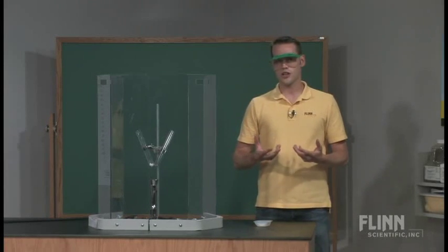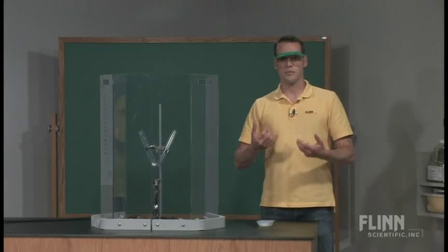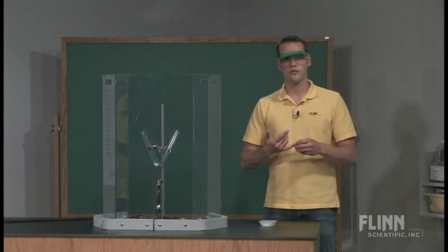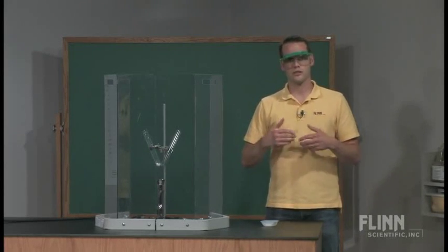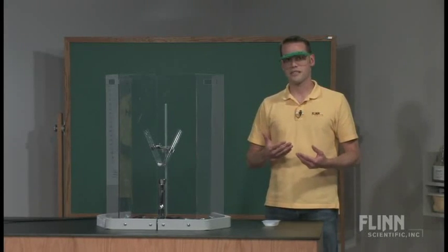This reaction also generates a whole lot of particulate matter that goes up into the air, and it can make your room very, very stifling if you don't have good ventilation. So this is not a good demonstration to do if you don't have proper ventilation or a fume hood. And if you don't have a fume hood, you definitely need to have some kind of a purge fan above this and safety shields and blast shields to prevent anything that might go to the side. It is very important to operate with this safely.